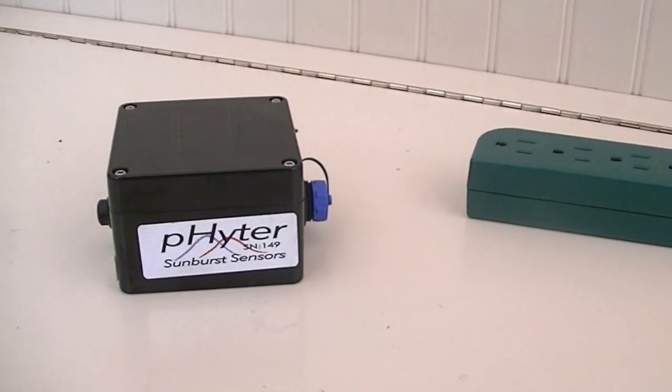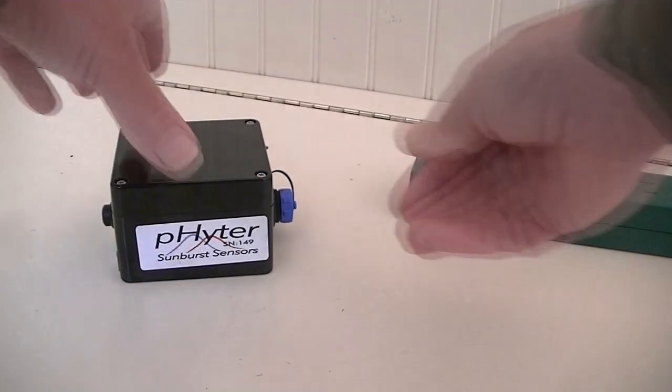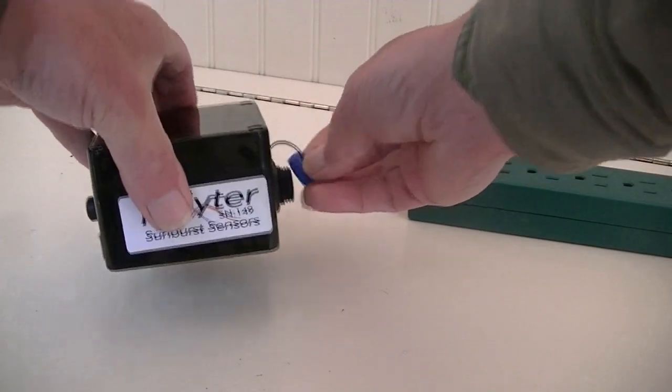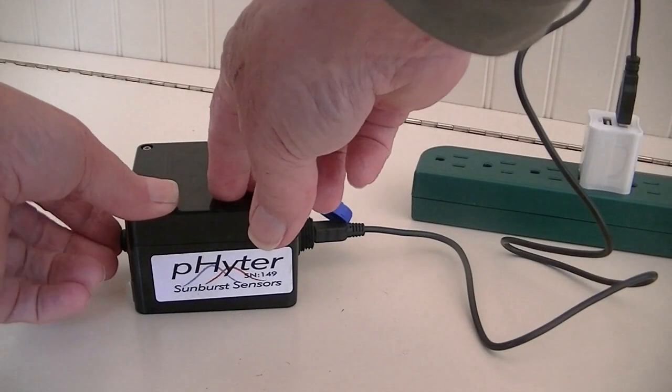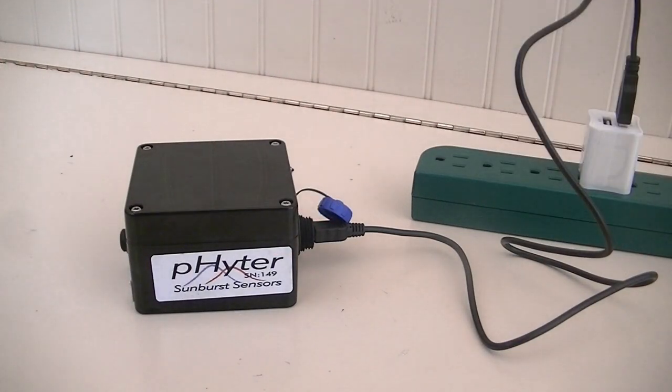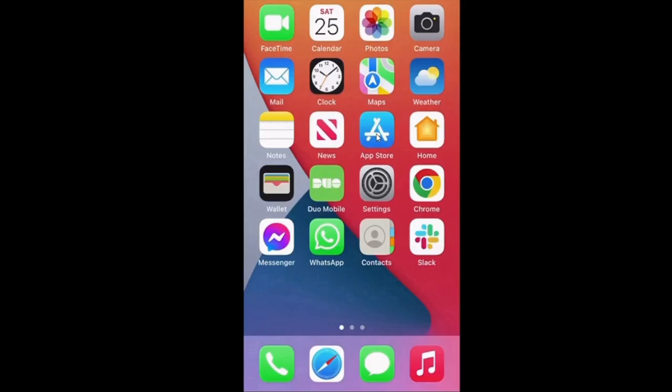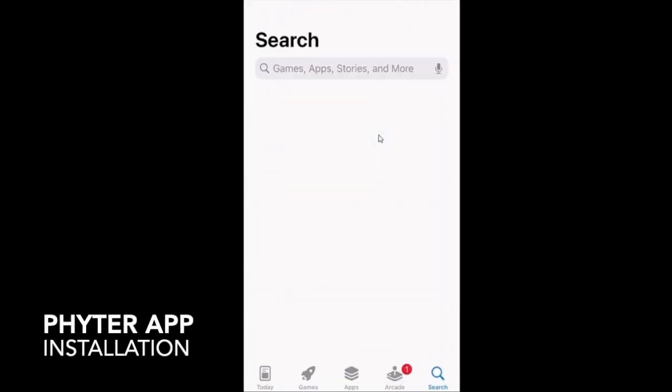Before using Phyta for the first time, we need to charge it up with a USB cable. Make sure you press the on button fully in. It takes a couple of hours or so to charge up. And once charged up, it will last for quite a few measurements.